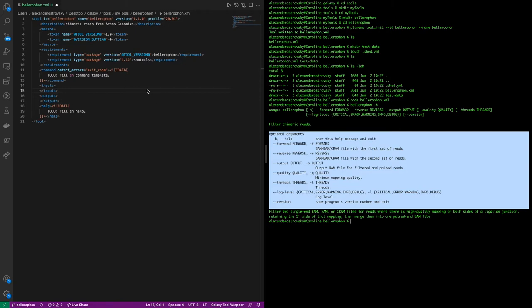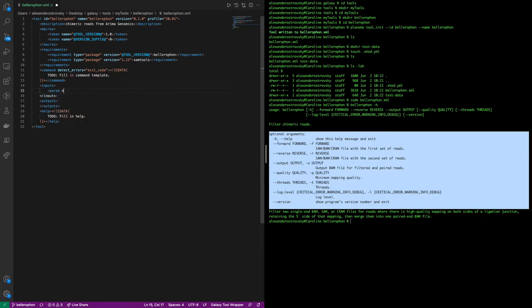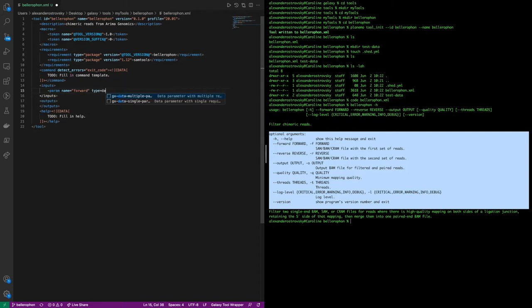Here, there are three parameters that should be accessible to the user. Those are forward, reverse, and quality. Output will be set as part of the command, but not directly shown to the user. Threads, log level, and version should not be exposed to the user either, and therefore will not be included in the inputs section.